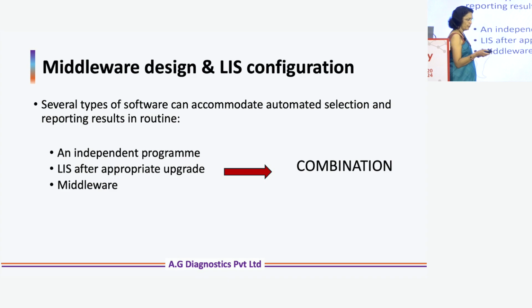Various types of programs can be used. You can either use a completely independent program for this, or you can use your own LIS after upgrades, or your middleware, or a combination of all these. So we use a combination of all these three things.